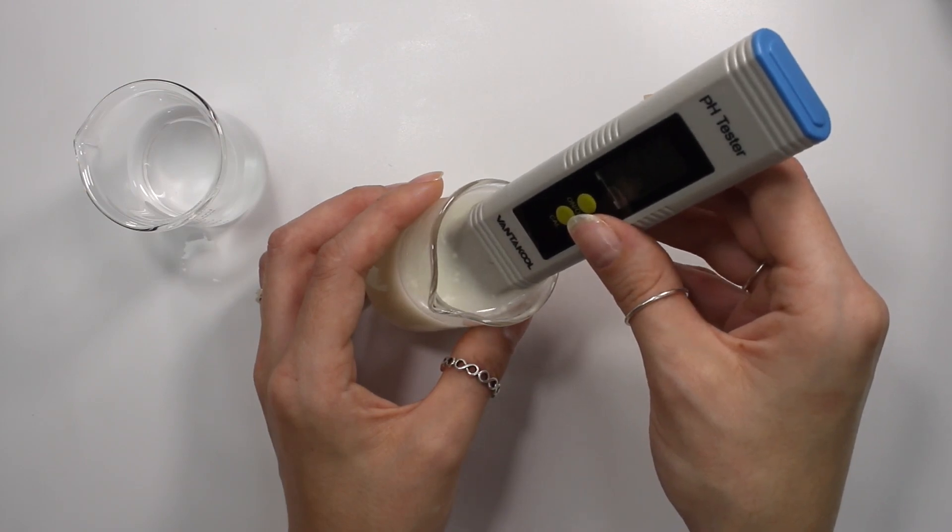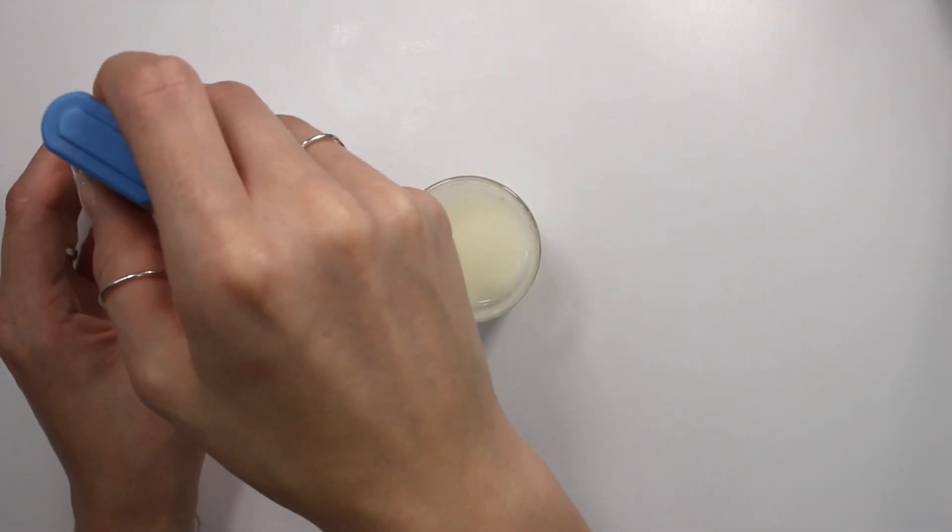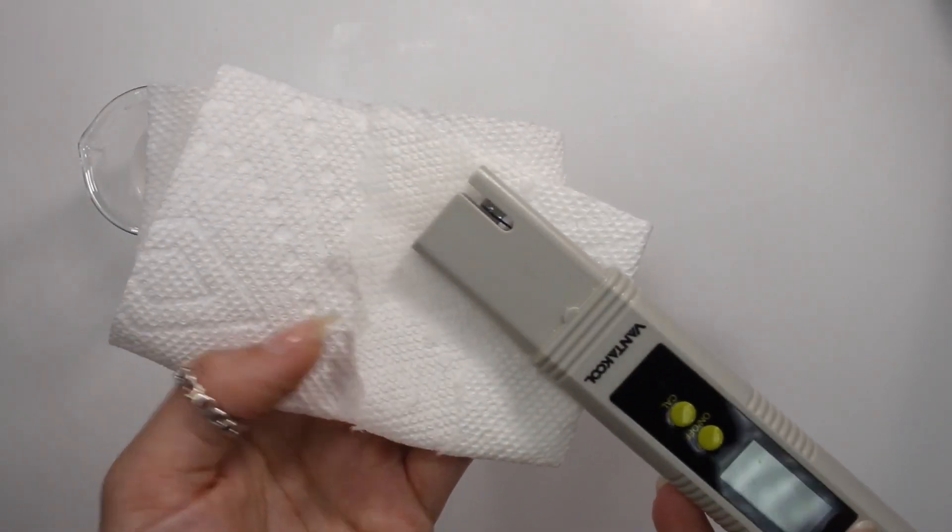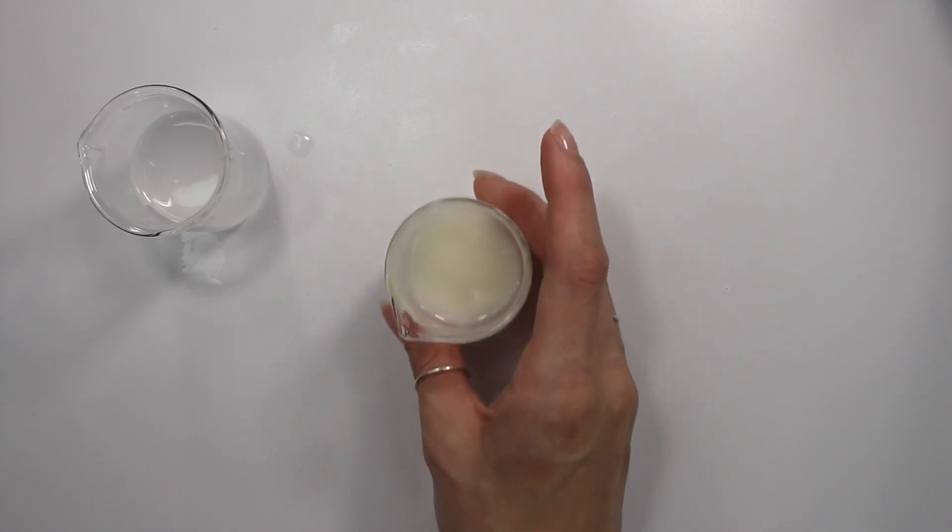But this pH meter is reading a pH of 5.08. So it's definitely reading a different pH. It's off by about 0.20, which isn't too much, but it's still a difference. So then you want to go ahead and rinse the pH meter in your distilled water again and then dry it off with paper towel.